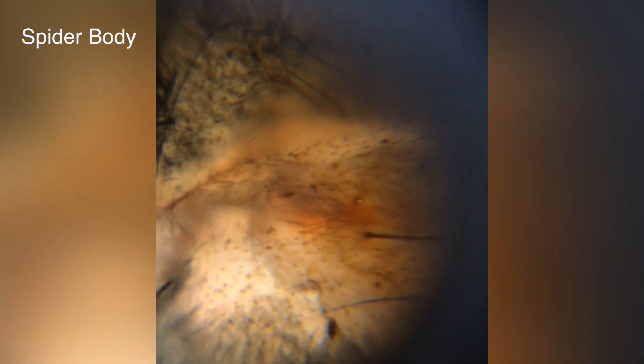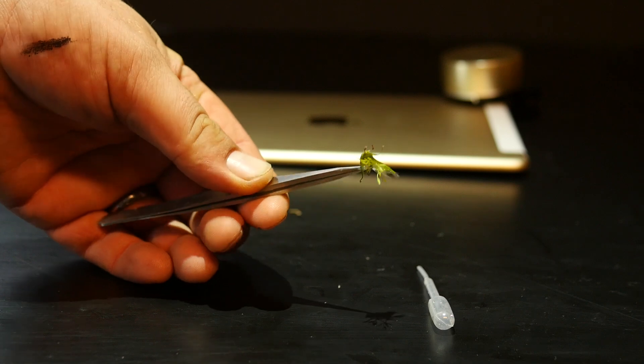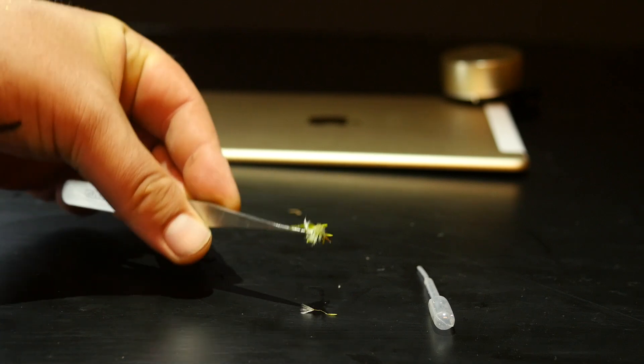You can take video or pictures right from your phone. It's a nice little small pack unit and it does have a one-year warranty on it. Here are the directions that come with it. They also have multiple slides, and these little tweezers — which are actually pretty nice for picking things up. They also include a little dropper if you want to do liquid samples.